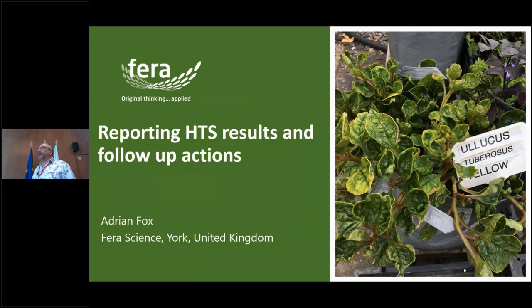So I come from FERA Science Limited in the UK. Back in the days that we were still called Central Science Laboratories, or CSL, we were among the first groups in the world to publish on the use of high throughput sequencing in plant health diagnostics. And that was back in 2009. Since then, a lot of our development work has been about how do we get HTS into routine diagnostics.